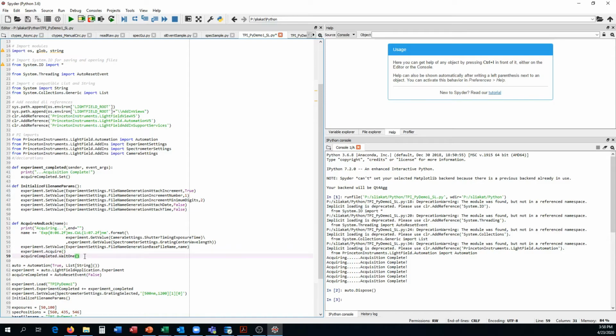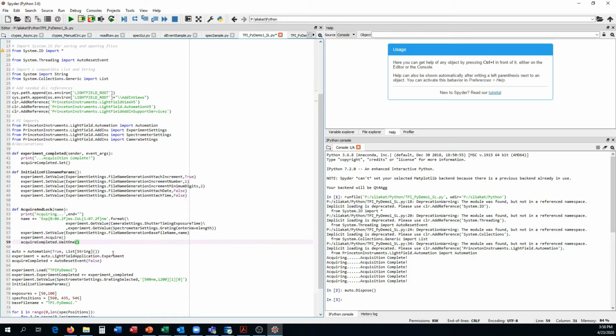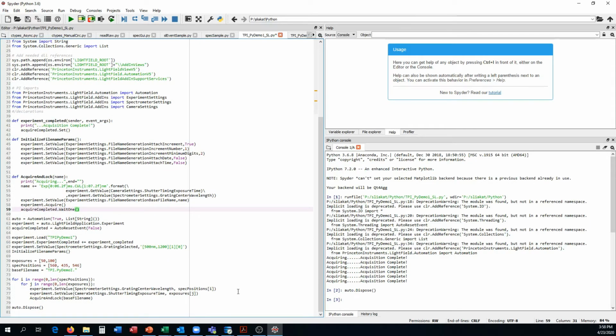And then we talked about the opposite of asynchronous functions, which is synchronous functions. Synchronous functions lock the thread automatically, and you can see here that when I set the center wavelength right here, if I go from 560 to 435, the spectrometer is going to take some time to move.